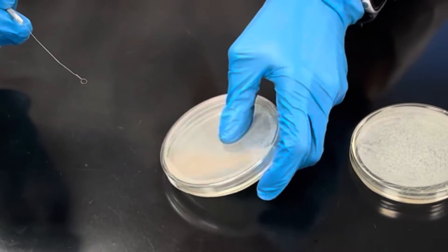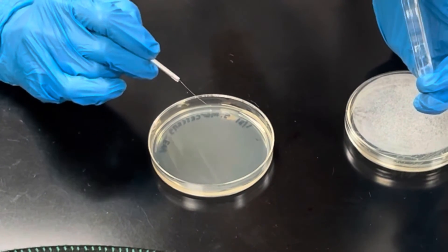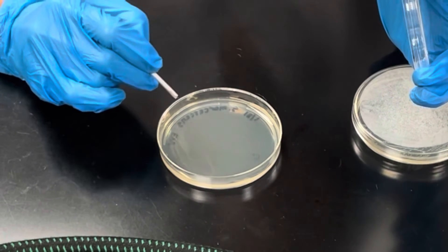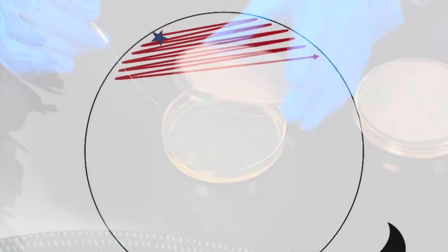Turn your plate over. Starting at the top, you're not as worried about crossing lines — just go all the way across making your Z pattern: one, two, three, four, five. Then stop.